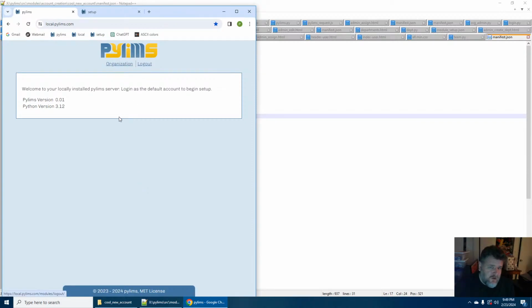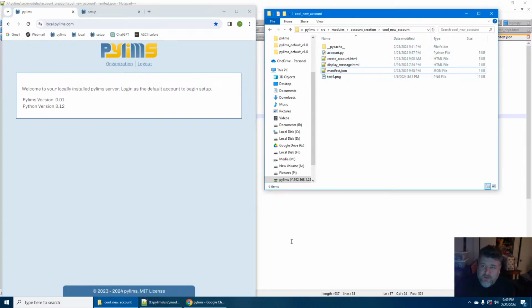So I haven't got too much of it done. I spent a lot of time on the back end of getting this all to work, because this is all working with Django in this dynamic environment where you create these manifest files and these folders, and they're all automatically loaded up by the server on an as-needed basis.